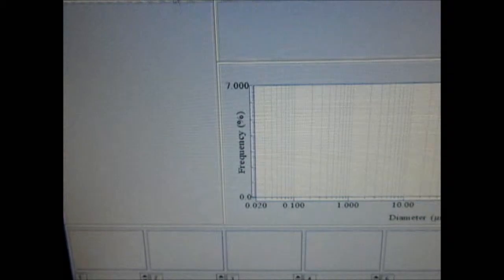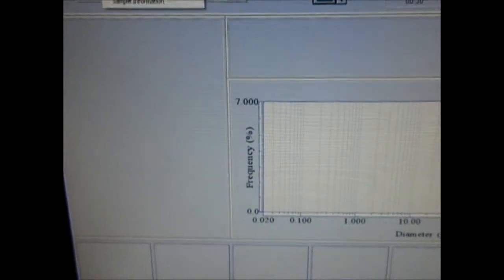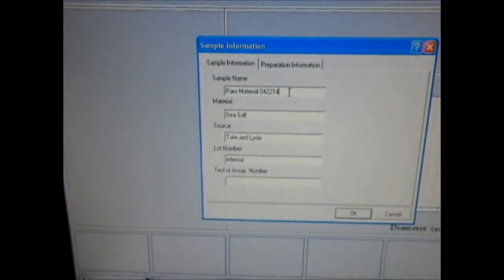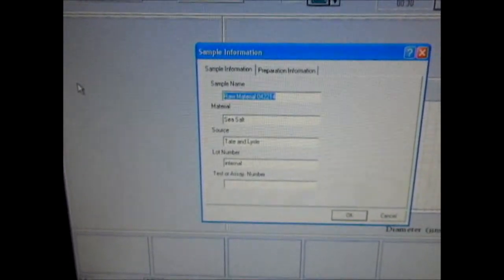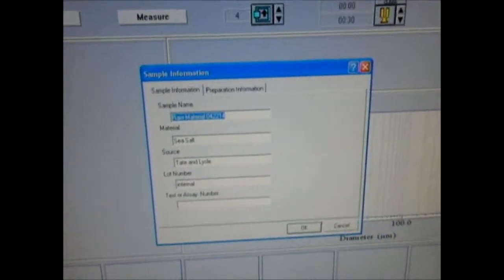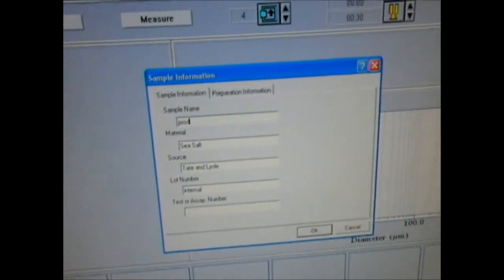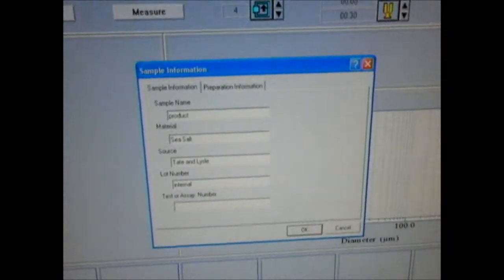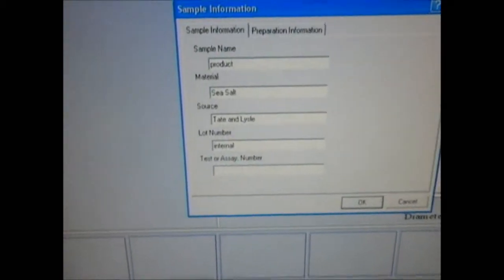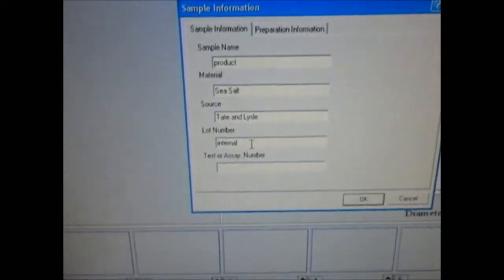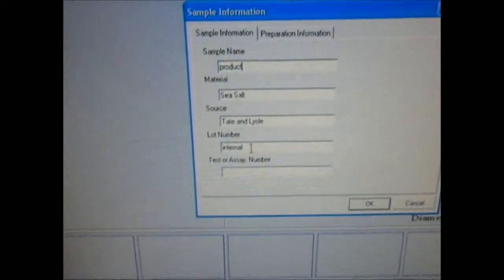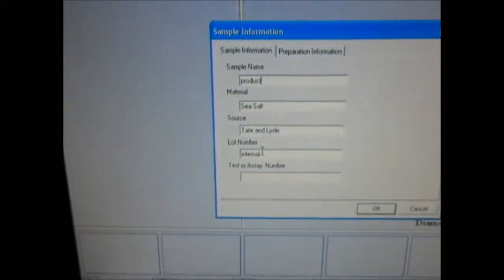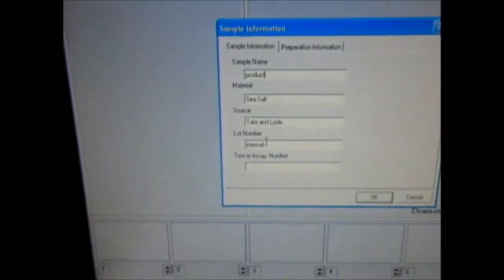After I click OK, I'm going to go to Sample Information and enter some information on the sample. The sample I'm going to test today is some product, so I'm just going to type the sample name as 'product.' If you have a work order number to track jobs, I would put this in the lot number field — this would make it easier to track the work on the LA-910.